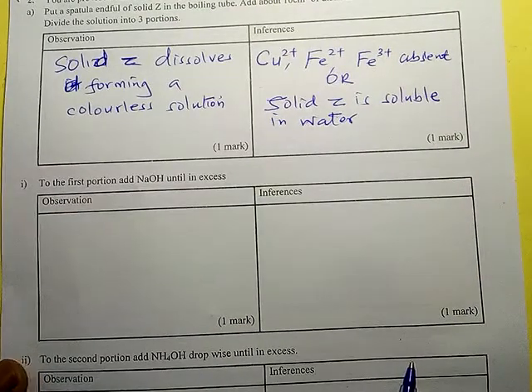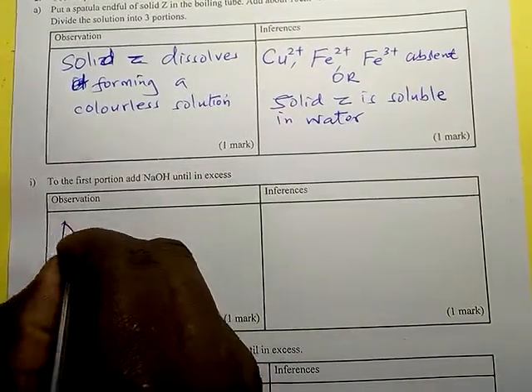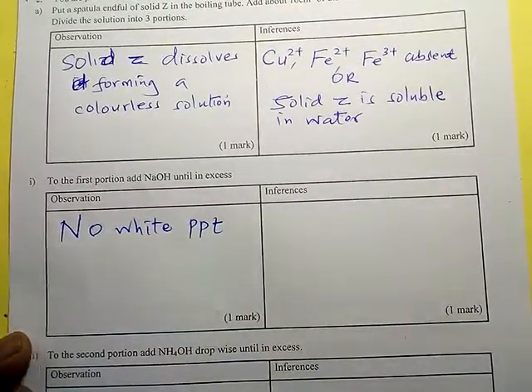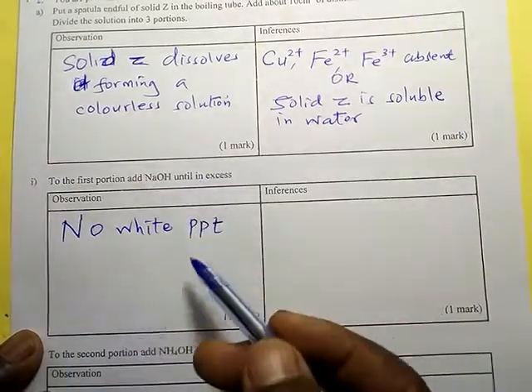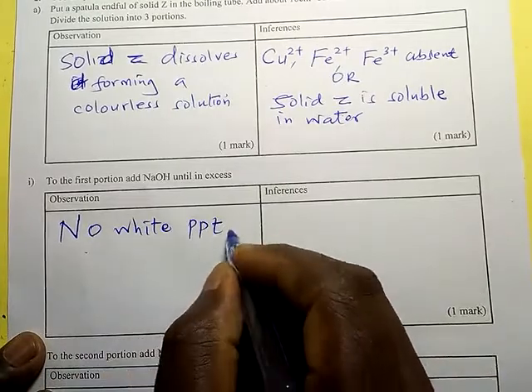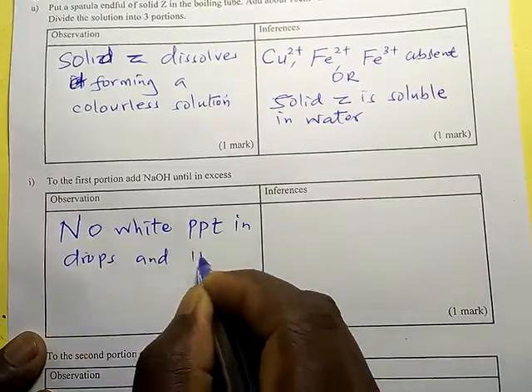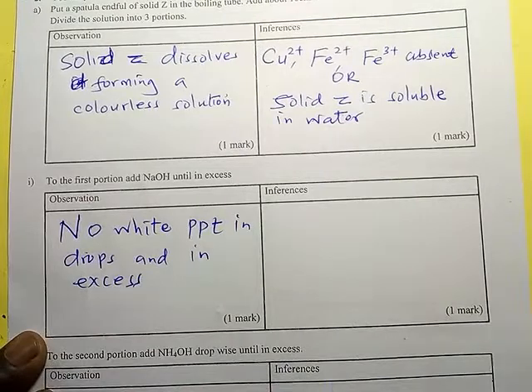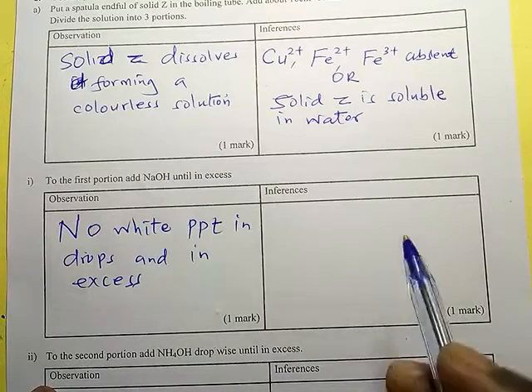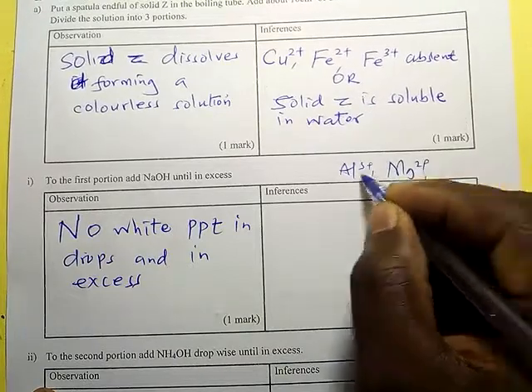To the first portion, add sodium hydroxide until in excess. We expect a white precipitate, but there is no white precipitate in drops, neither is there a white precipitate when in excess. If there is no white precipitate when you are adding sodium hydroxide, it simply means that there is no aluminium ion. Aluminium ions are not there, magnesium 2+, or these so many ions are not there.